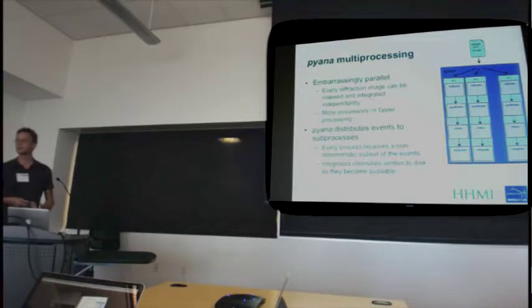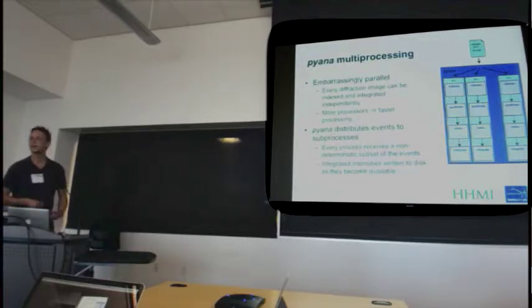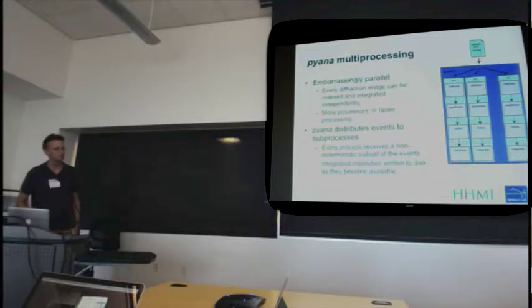And this was made even easier for us because PyANA, the stack provided framework, already had this functionality in place. The way this would work is that we would take an XTC stream and feed it to PyANA, and PyANA would then split out the frames inside that stream to different processors. Inside every process, we would apply the hit finder, based on spot finding, and then index and integrate each image, and we can do that in parallel.